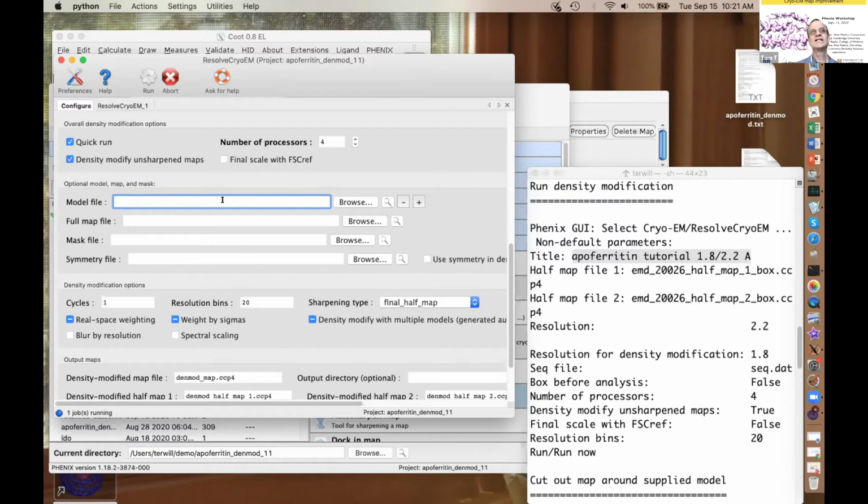And then in the density modification process, the density that's calculated from the average of a group of models for a particular half map is used as part of the information about what is good. As soon as I'm done saying this, I'll tell you how this works. Basically, we're going to use some model-based information, and we're going to use the variation between densities corresponding to these different models as an estimate of uncertainty in the model-based map. We're going to combine that with the information from just the map that's already there. And that combined information is going to give us a better map.